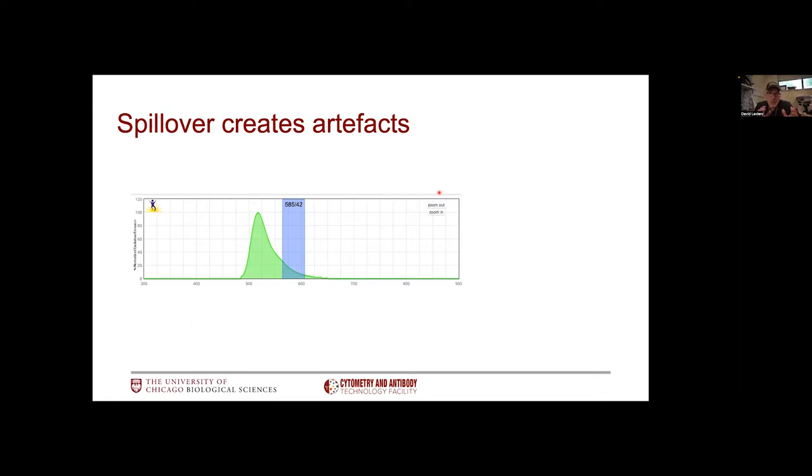To discuss spillover, we're going to focus on this example of FITC bleeding in my PE channel with the 585-42 bandpass filter. If I was to run a sample of cells stained with only FITC, this is the type of data I would expect on the instrument. X-axis is my FITC signal, PE is on the Y-axis.